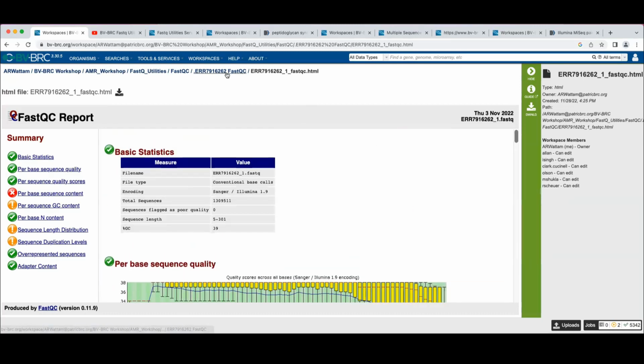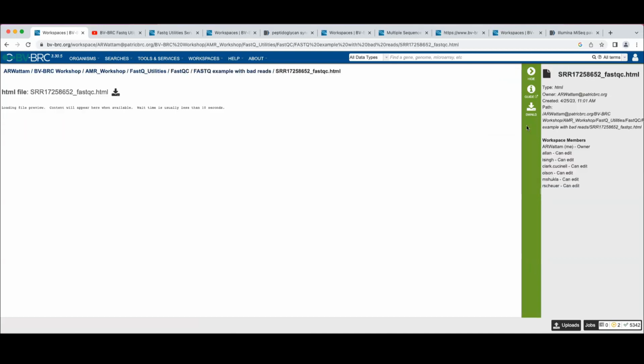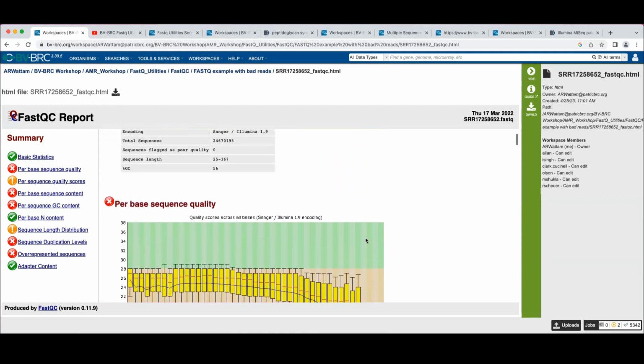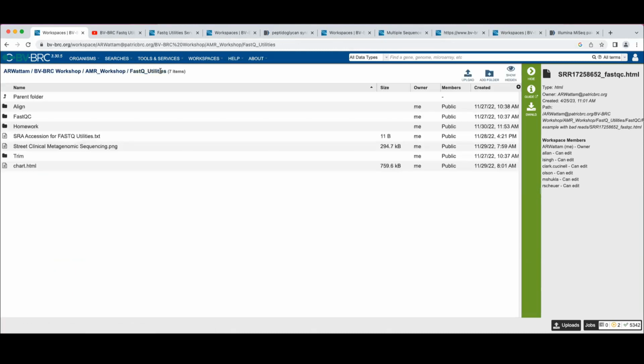One thing, when I first started running FASTQC, I didn't know what bad reads looked like. So I didn't have a thing to compare it to. I couldn't tell what looked good and what looked bad. So I included a bad read to show you. Okay, and look at that. No green, all orange and red. Ick. If you have this, you go back to the drawing board. Green, good, others, bad. Okay. So that's what it looks like on the FASTQC, which is the quality.